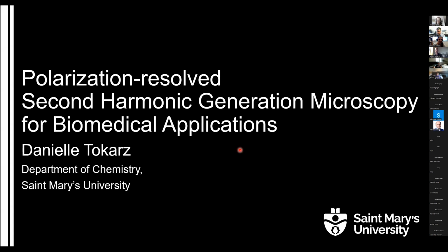So the title of my talk is Polarization-resolved Second Harmonic Generation Microscopy for Biomedical Applications. In my research group, we focus on developing nonlinear optical microscopy techniques to study biological materials for biomedical applications, to add to the diverse set of visualization modalities for improved health and to better understand biological structure-function relationships.